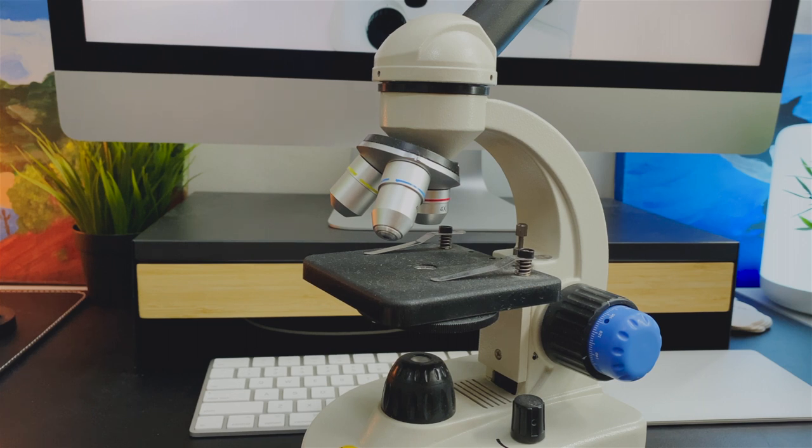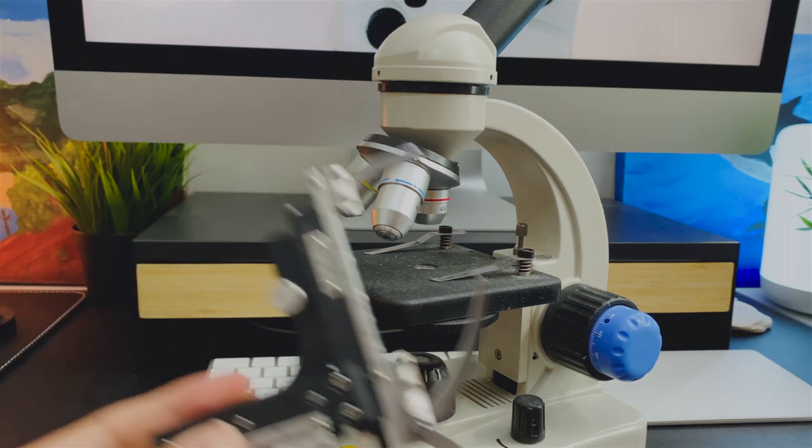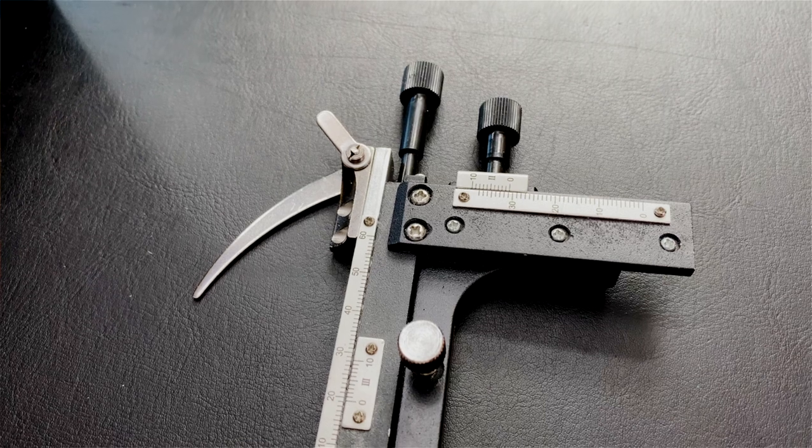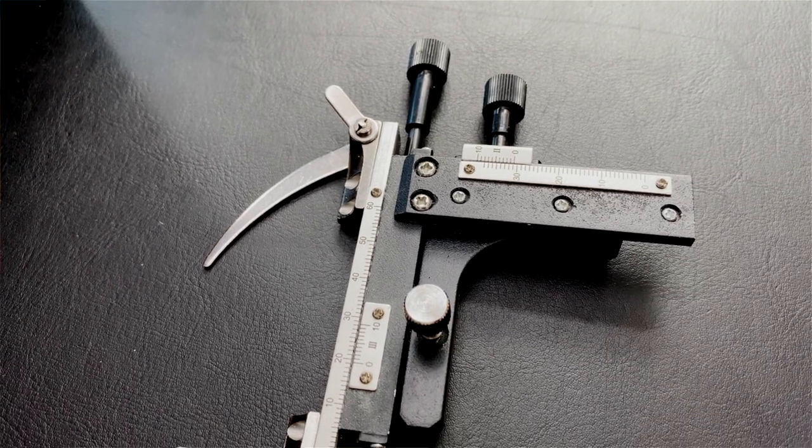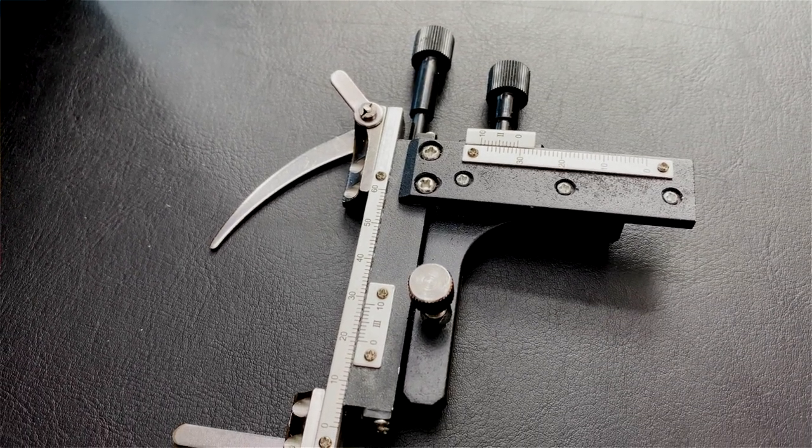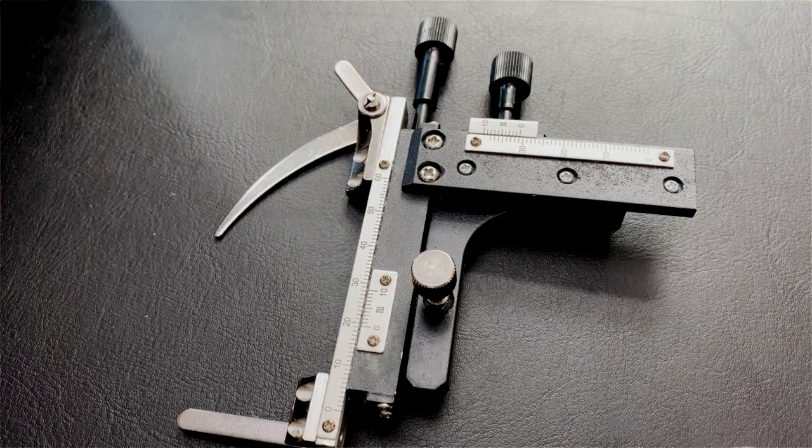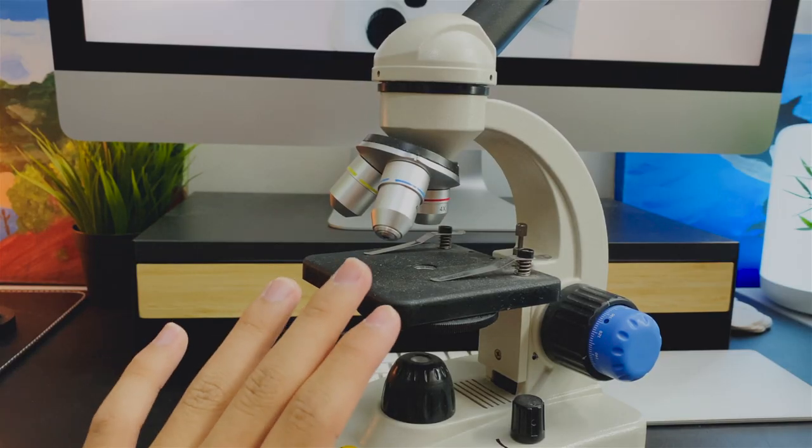But there's actually a cheaper solution. Buying third-party mechanical stages like this for $10 to $20 can transform a cheap microscope to a much better one.